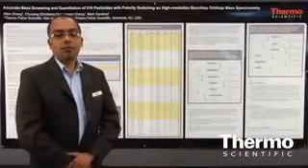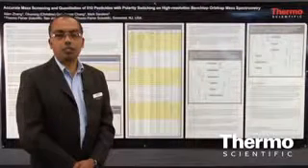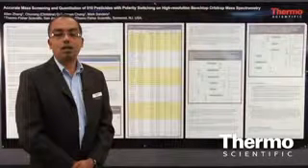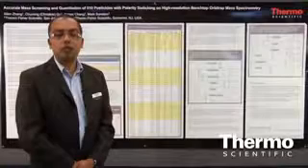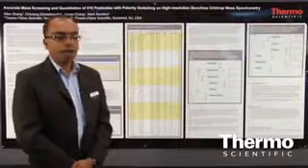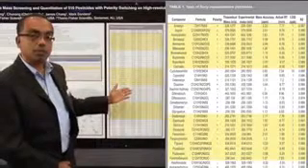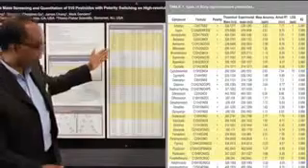And the Exactive Orbitrap platform is an ideal instrument for this because it operates in high resolution mode and has extreme high mass accuracy. Typically we can achieve mass accuracies to less than 2 ppm. And here what we have is an example of 60 of these pesticides, a snapshot of the 510, and I'll just take you through what we're displaying here.